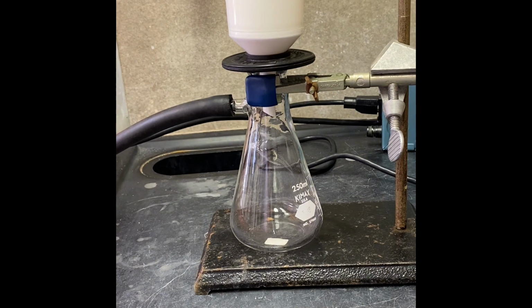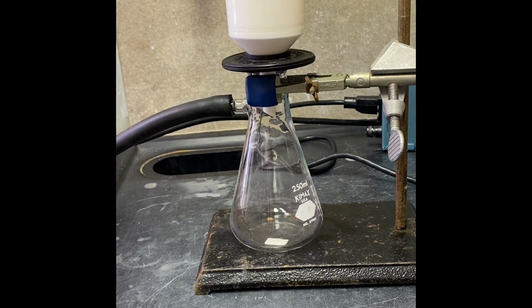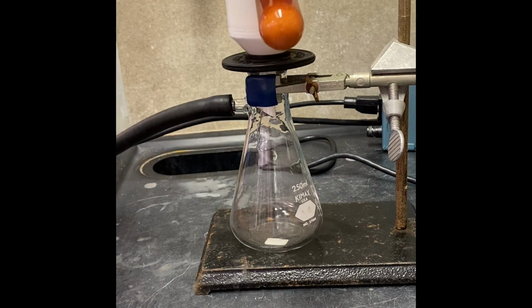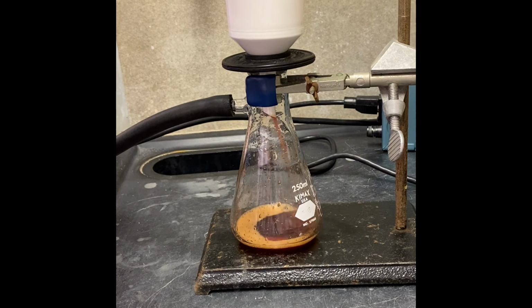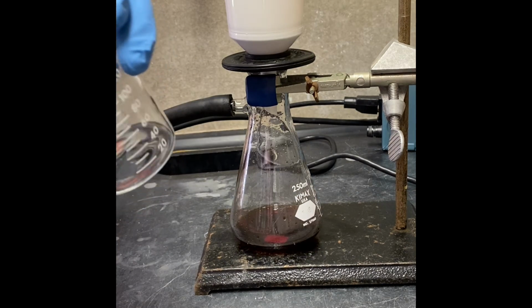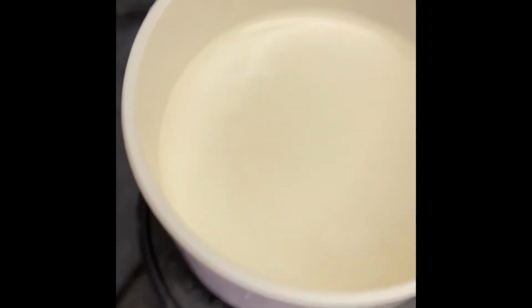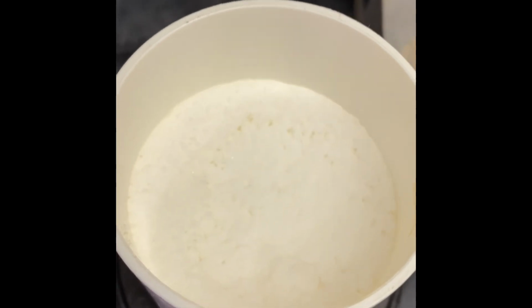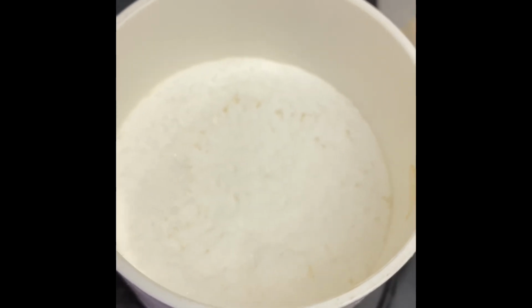And now we're gonna filter reaction product. Grab our reaction flask. As you see, that much product we have now. Our crystal is supposed to be white. We pour some methanol, and now I'm gonna turn on back the vacuum, and as you're seeing, it's gonna be white. Nice product.